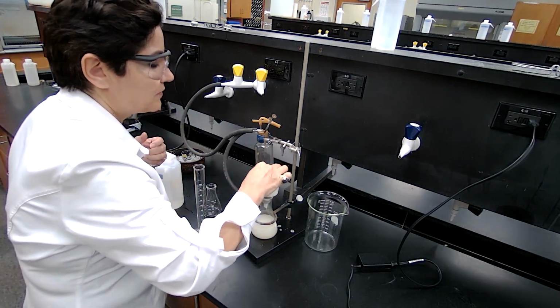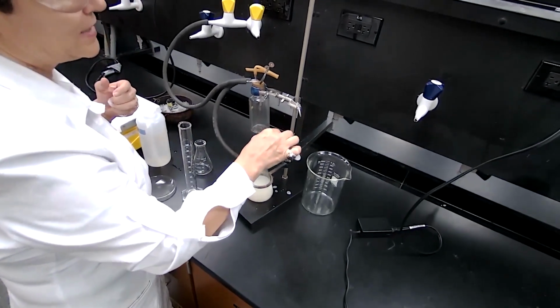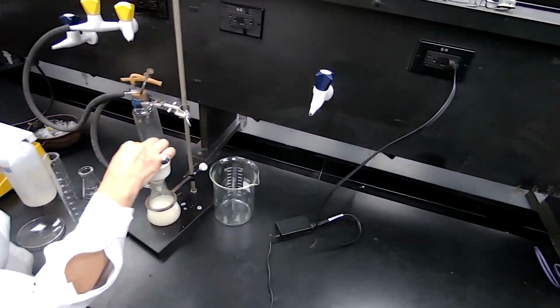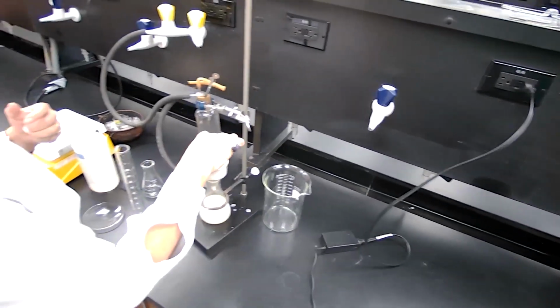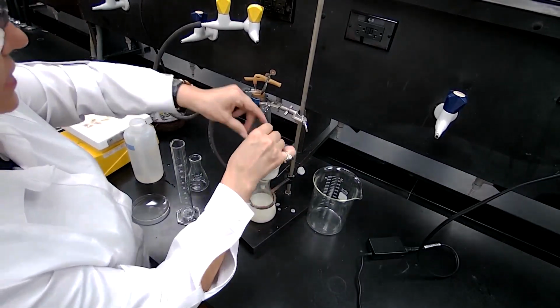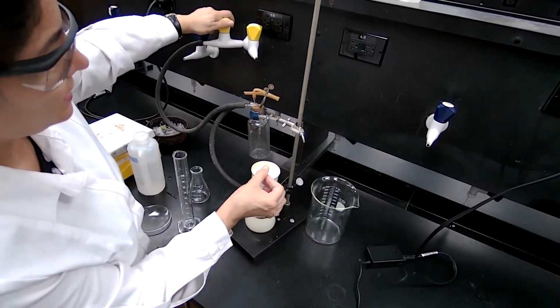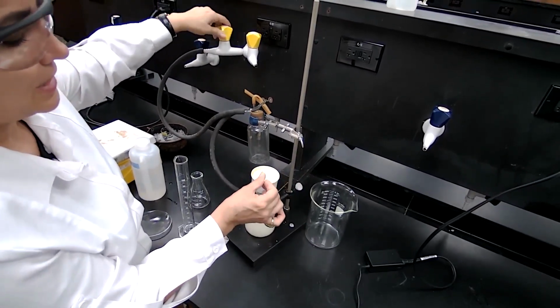And what is the purpose of this washing? To remove anything that is water soluble, and specifically to remove all of the sodium hydroxide. Continue washing until the solution that is filtered, the filtrate, is not basic anymore.